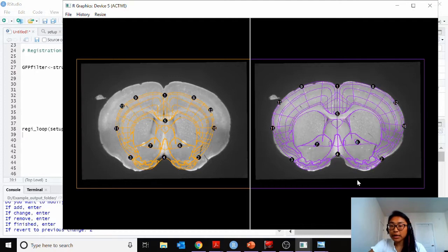Yeah, that looks pretty good. I'm just going to add maybe 4 more points on the bottom, but I think after that, this is good to go, right?